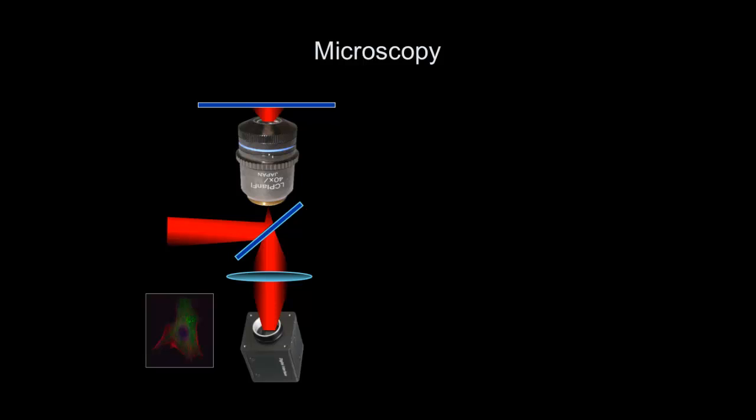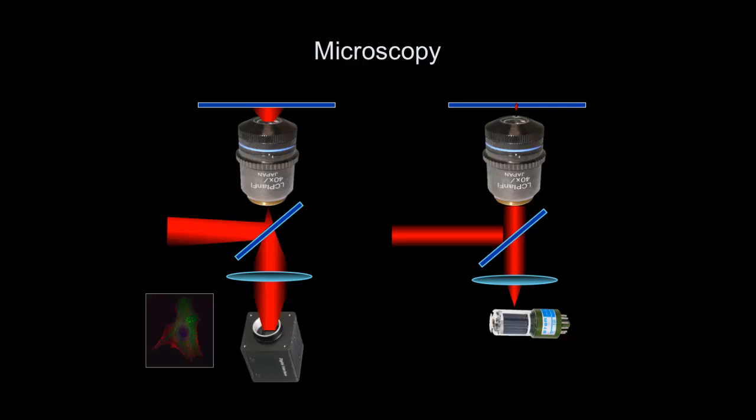There's a little cell here, and the resolution is what you're kind of used to, or familiar with, from an optical microscope. It's sub-micron. This is another way of doing the same thing, really, but instead of using an arbitrary light source, that's for instance a light bulb, you use a laser. And the laser has a very interesting property. It is collimated light. And if you send collimated light into a perfect lens, you create a focal spot. Let's have a look. There it is. This is a focal spot. It's a tightly focused spot, and the size of this focal spot should correspond to the resolution of your microscope.